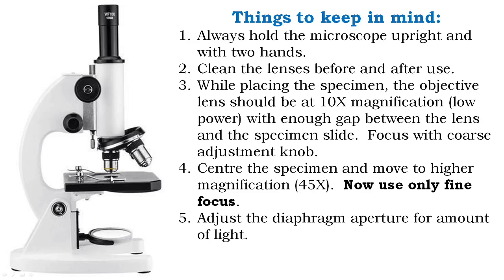Objective lens ta specimen ni para la gap shara lag mar gap shara mala du zambala ani ko kharche yore kisi kirangi course adjustment page chewi imbana chewo di digal ma tu ni specimen gal tu ni yamena chewo gyon shogre ro lens gyon shogre yamena specimen chaya nyang gar yi nu zambala. You have to always use fine focus yu chung swa iche. And then finally kisi kiran light tagda digi mindu samba imbana nya khalas tanji diaphragm da aperture di change chaya la, so diaphragm, iris diaphragm and condenser ge ji aperture chumarwe di change chaya.